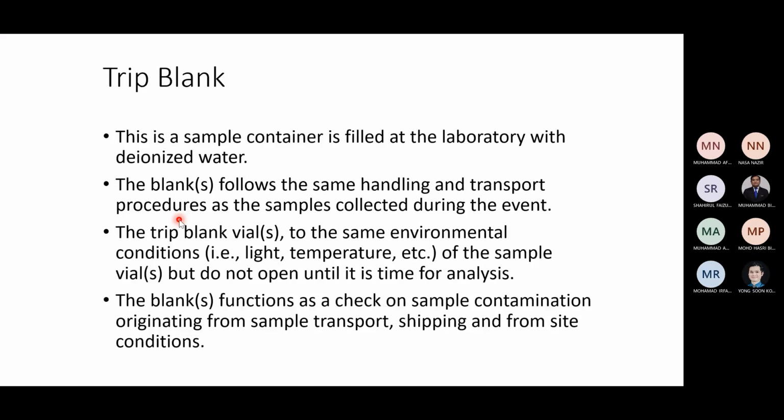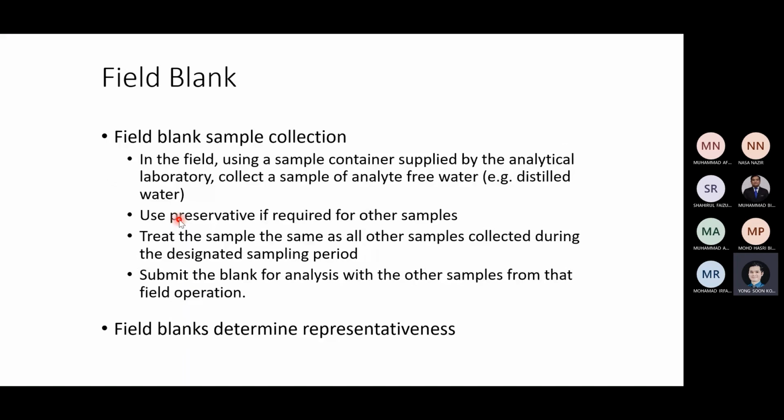Now, the other one is called field blank. Don't be confused. This one is more or less the same. The only difference is that this field blank is filled at site. Just now, trip blank is filled in the lab. But this time, the water is filled when you arrive at the site. Before you start collecting water samples, you open the empty container, fill it with deionized water, close it back, and then you continue with the rest of the samples.